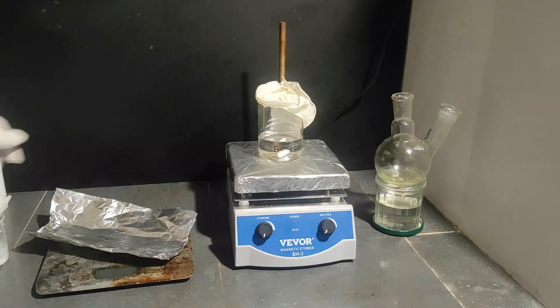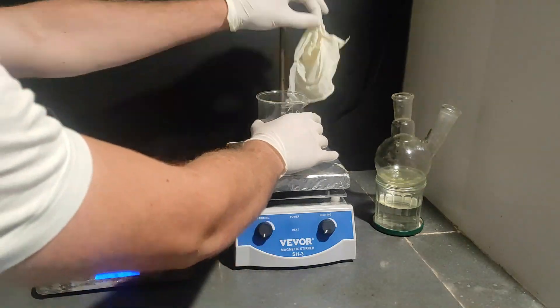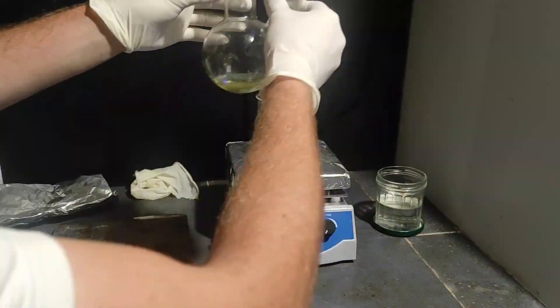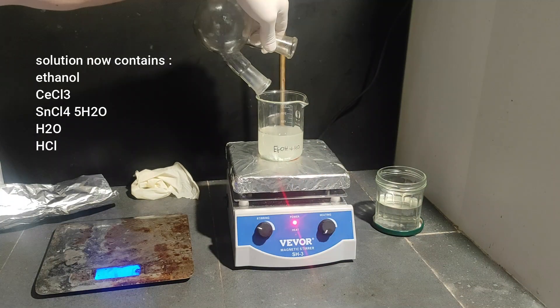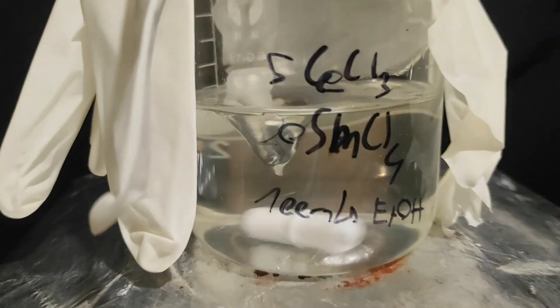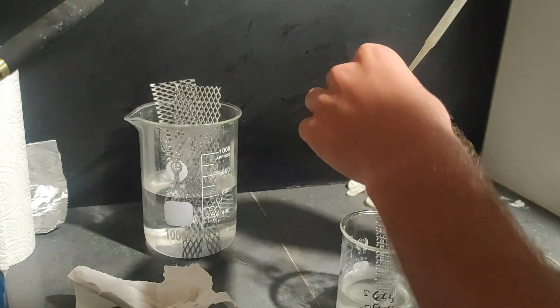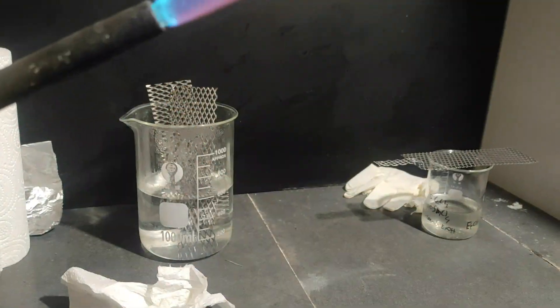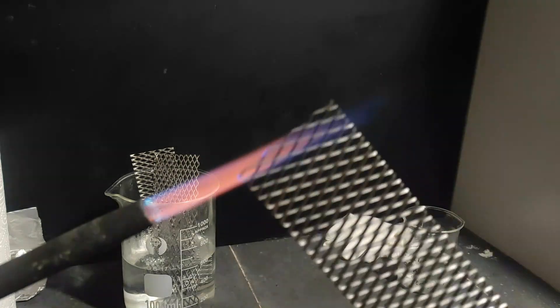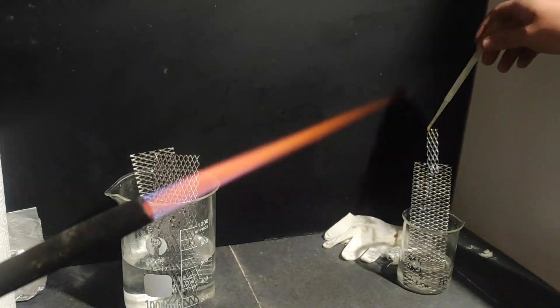To make the coating solution, we just add our cerium chloride to some ethanol in a beaker, and then add the tin tetrachloride solution. I covered the beaker with a glove for stirring, and also bubbled some HCl gas through the solution to prevent decomposition of the tin tetrachloride. I dried one electrode with paper and dripped the coating solution all over it. To remove the solvents and be left with a solid coating, I blast the electrode with a blowtorch until it takes on a white color. I repeated this step about 20 times for a good thick coating.